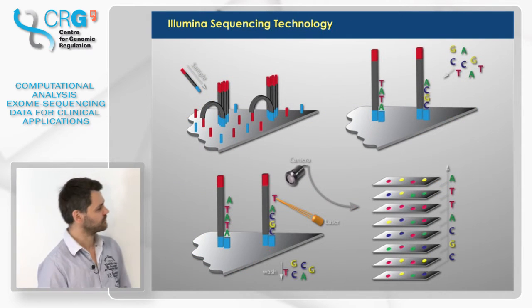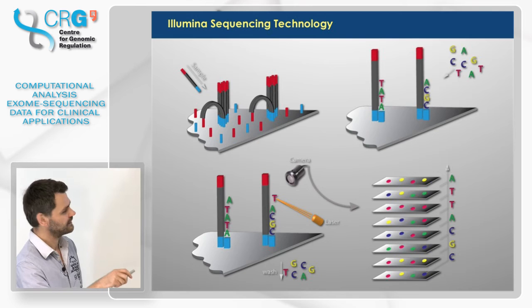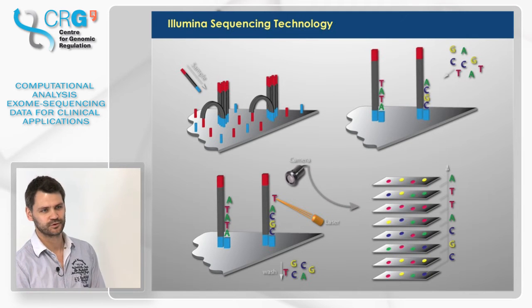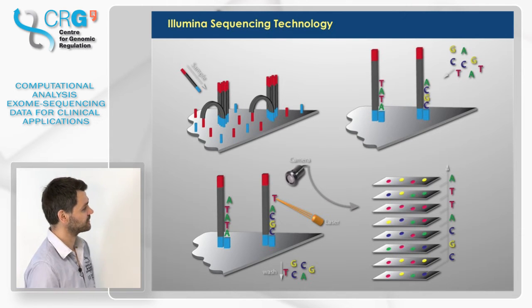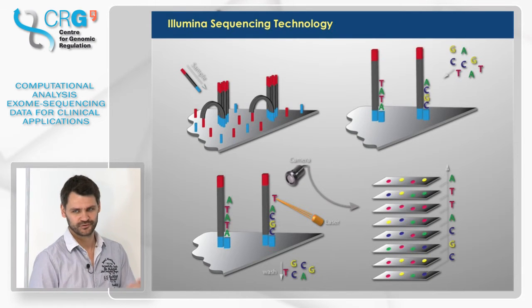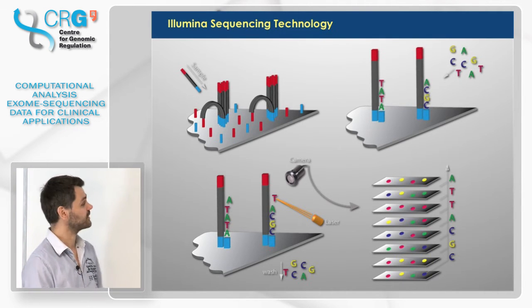For the people who may not have a good background in Illumina sequencing technology, I give a single technology slide on how this whole thing works. The idea is that you have your big genome, you sample from a person about 1 million cells, and the DNA from all these 1 million cells you break into small fragments, let's say 200 to 500 base pairs, something like that. So what you see is not the genome of a single cell, but many cells. In the future, this might change. At the moment, we still do sequencing of about 1 million cells per sample.